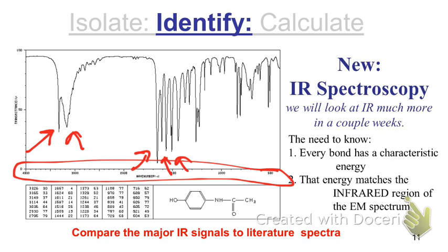The bonds, which means what would you expect for the IR spectrums for each of those compounds? They should be different. So what you're going to be expected to do is to use the IRs, our standard IRs that should be posted on Blackboard, and you'll compare your IR, your obtained sample, to those standards and try and match it that way. Okay? A couple things that I'll also address on this.